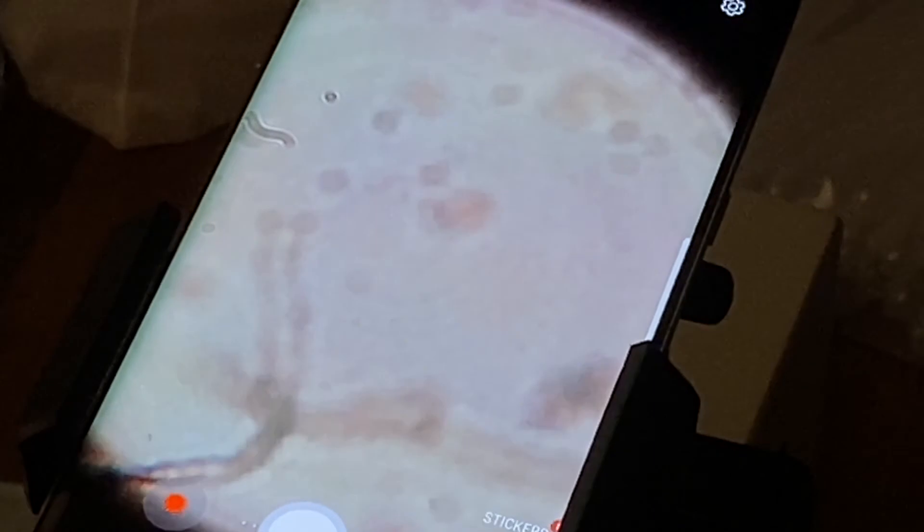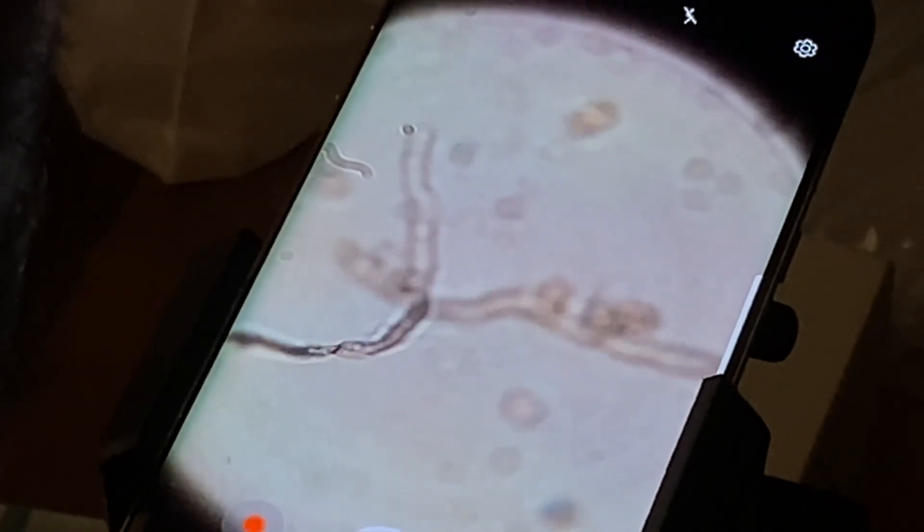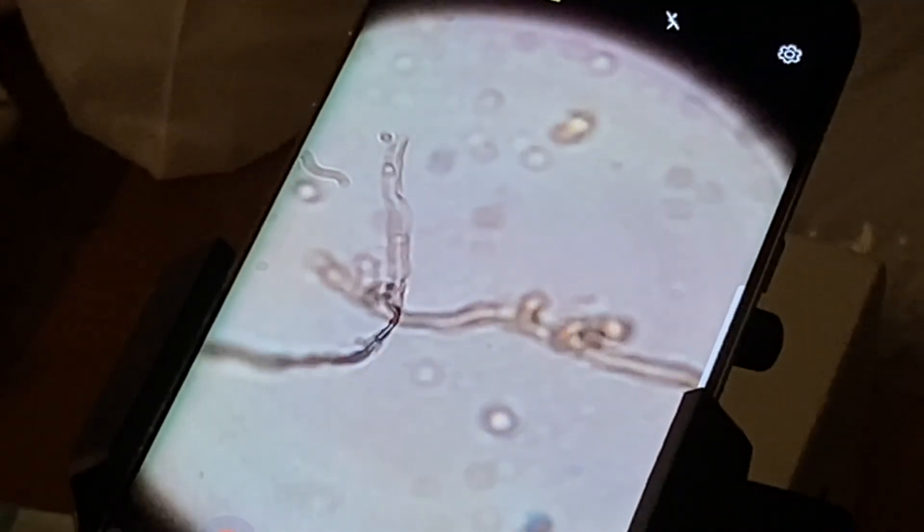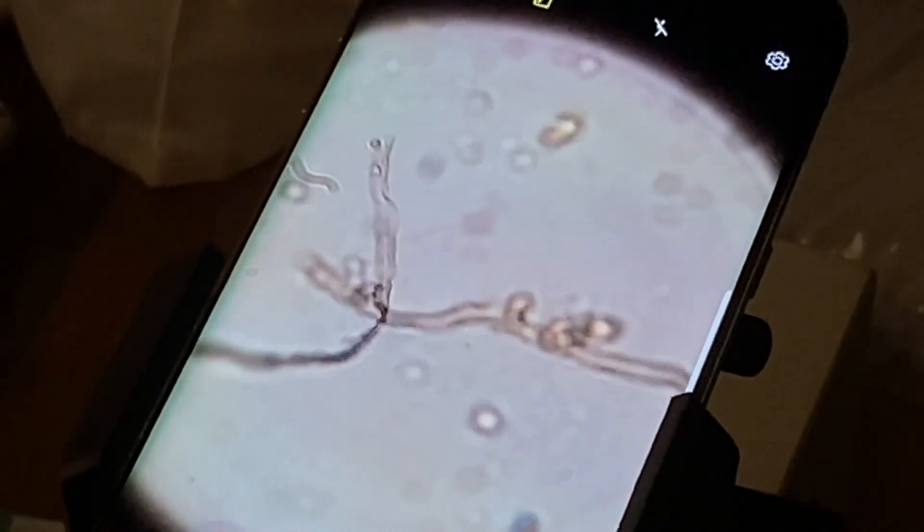I'll systematically move my way up and down, left to right. That's just an air bubble there. Looks like some new fungi — yeah, here's some new fungi. You can see the segments; it's a little bit light in color, but it looks like it's probably just a new strand.